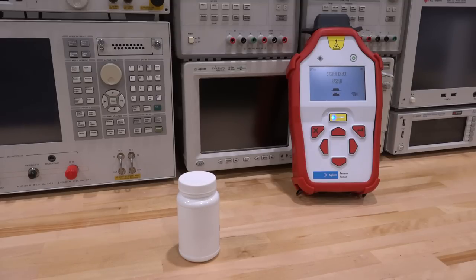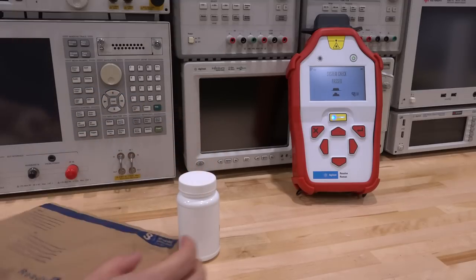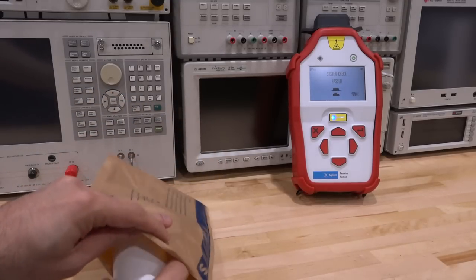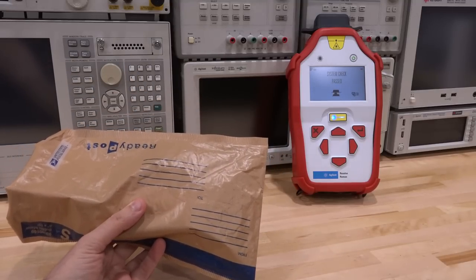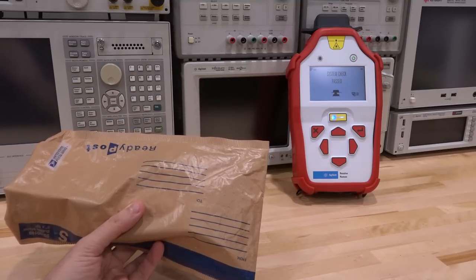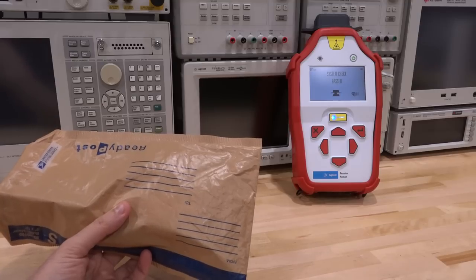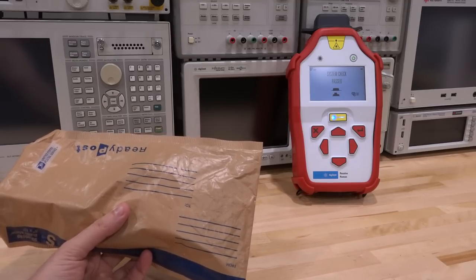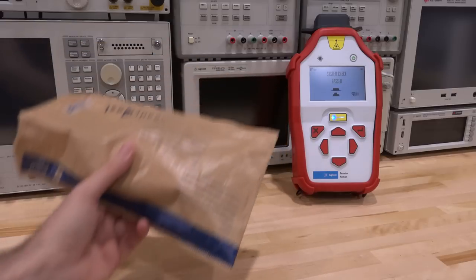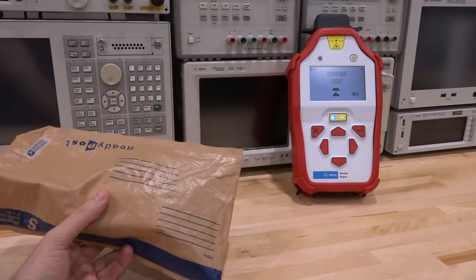We could always x-ray the bottle, but a regular x-ray isn't going to really help us much beyond telling us there's something inside. Let's make the situation even more complicated. We're going to take one of these shipping bags, put the bottle inside of the shipping bag. Now it is even more mysterious, because we have several different kinds of materials all on top of each other. This brown plastic is a totally different material than what the bottle was made of, not to mention we're still interested in the powder inside.